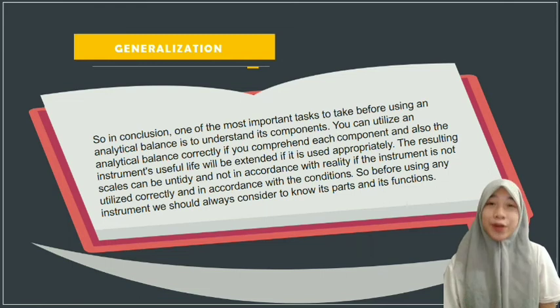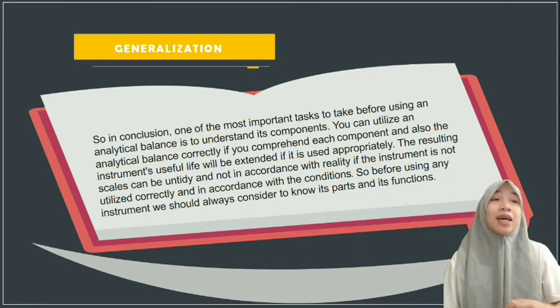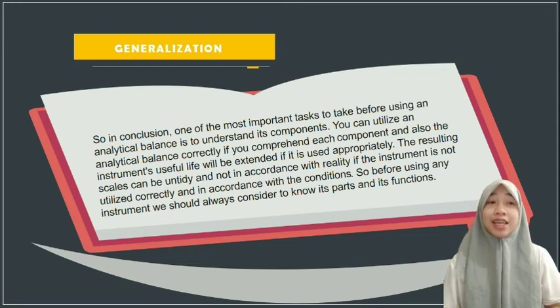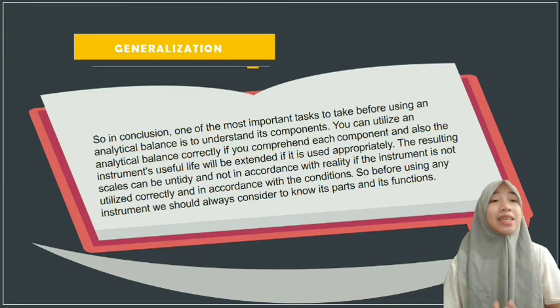My conclusion for today's presentation is this: one of the most important tasks to take before using an analytical balance is to understand its components. You can utilize an analytical balance correctly if you comprehend each component, and also the instrument's useful life will be extended if it is used appropriately, of course.